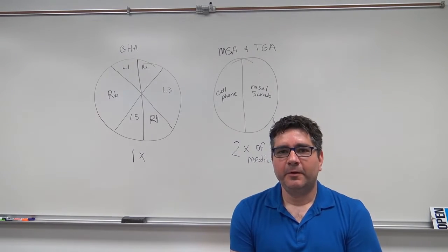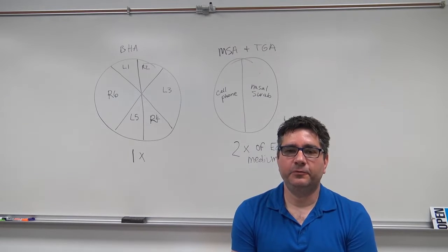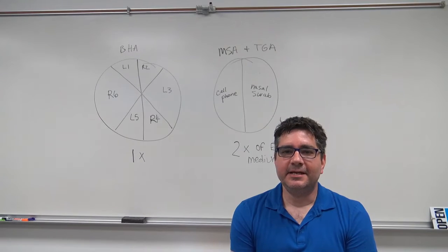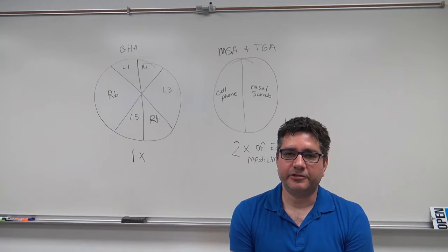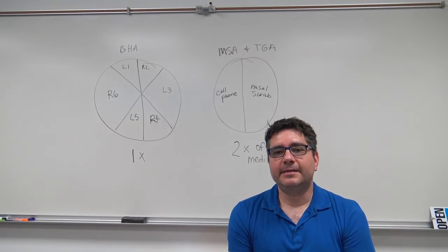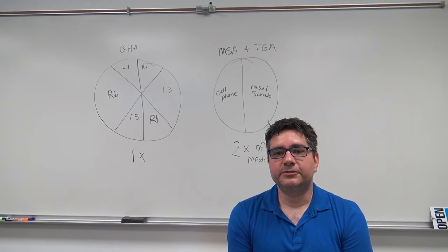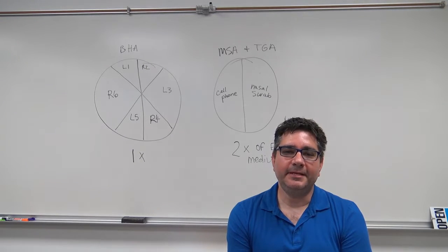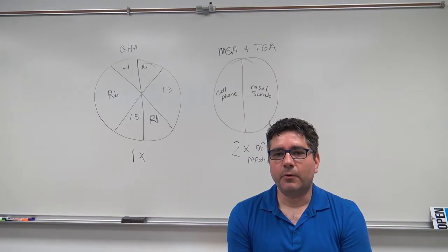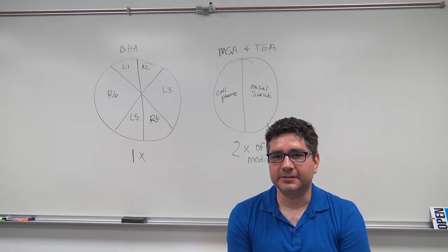Hello everyone. We've been looking at various cultures I've prepared for the past few weeks, and as you can see, it can be very hard to look at a microorganism in isolation. Even though aseptic procedure, when followed correctly, can prevent issues of contamination, a microbiologist may employ a medium that is either differential or selective toward a specific organism or organisms.